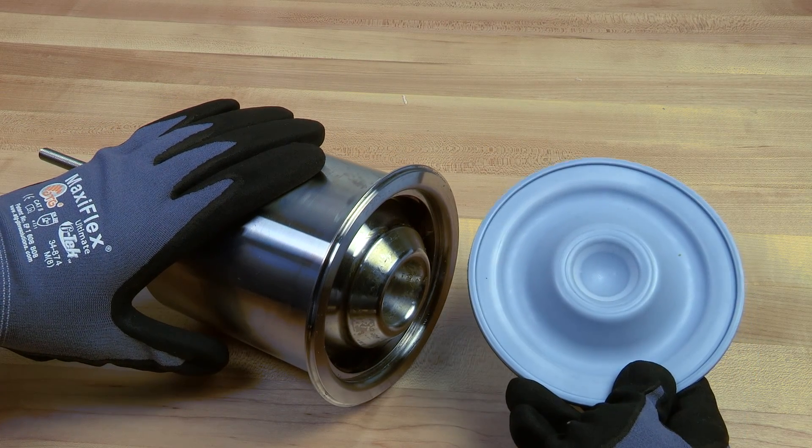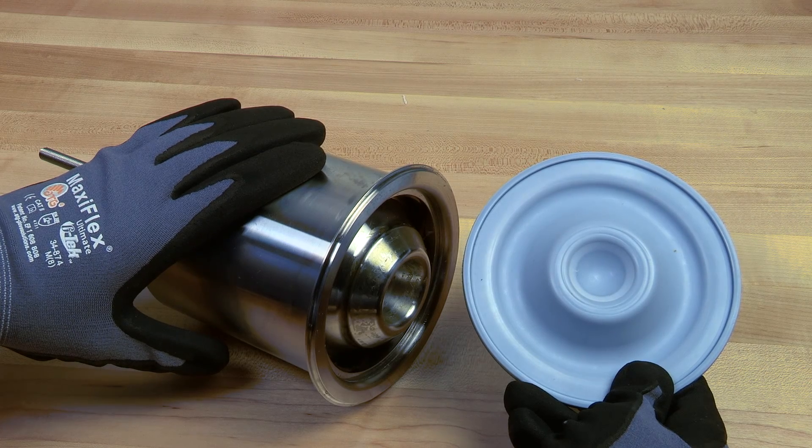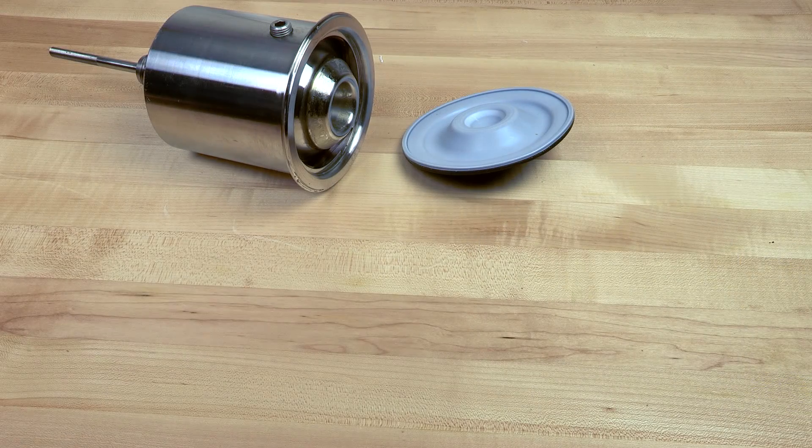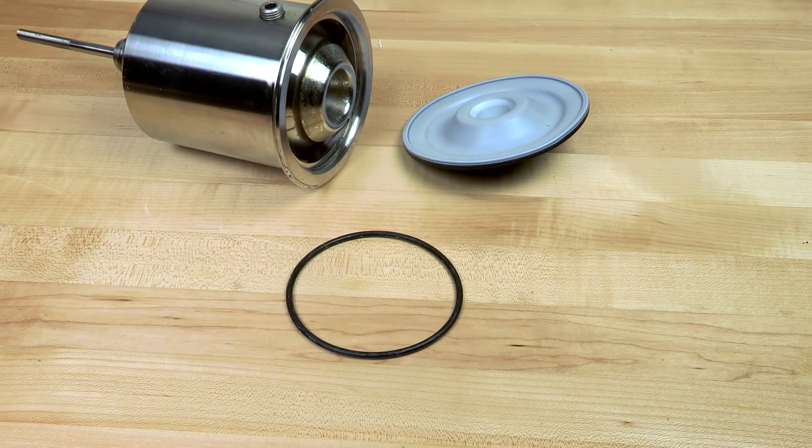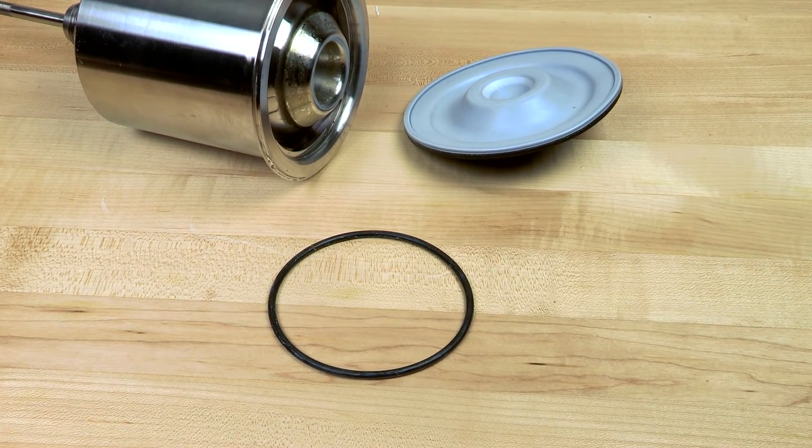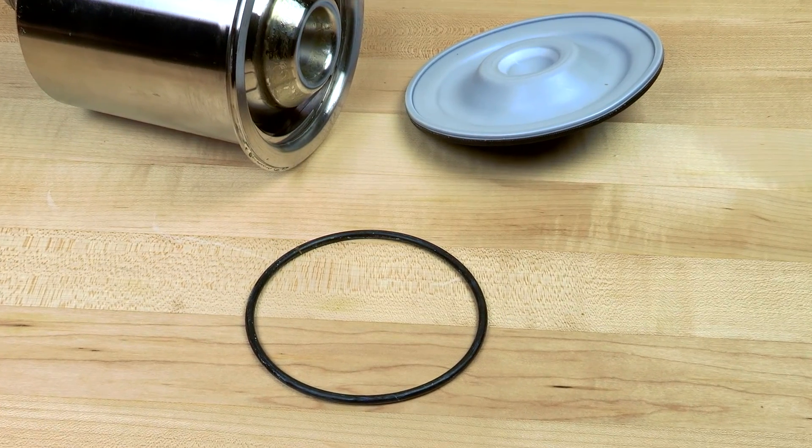With the bonnet assembly complete, it's time to install the diaphragm and attach the assembly to the valve body. When installing the diaphragm, you must first install an O-ring which helps protect the diaphragm from wearing against the bonnet on 1.5 and 2 inch valves only.